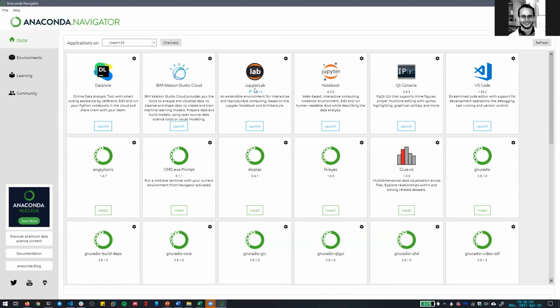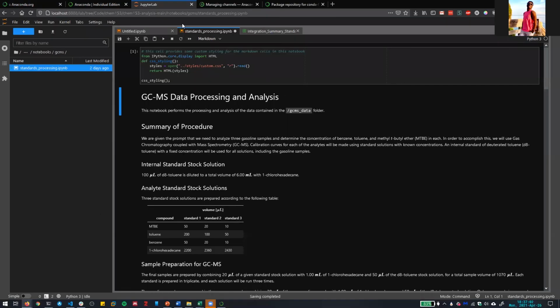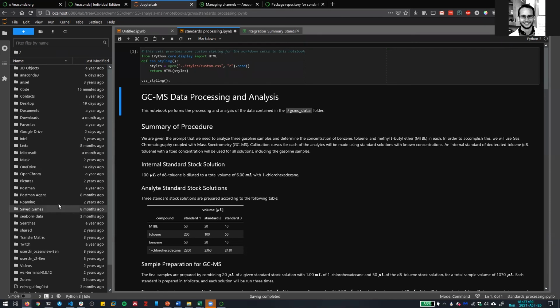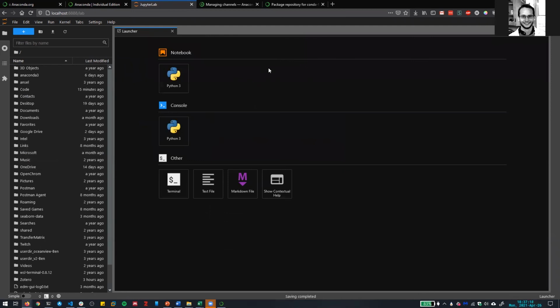No, it should be fine. So if you launch Jupyter Lab, it should automatically open a new browser window. And then it should basically just be in wherever your user directory is. So I've got a bunch of stuff in mine. You probably have not as much stuff. But do you see this kind of window minus all this stuff, something like this? Yeah. Okay. And does it have just a notebook open that says Untitled at the top? Yeah. All right, you can close that.